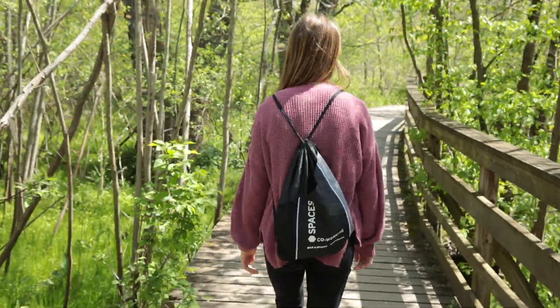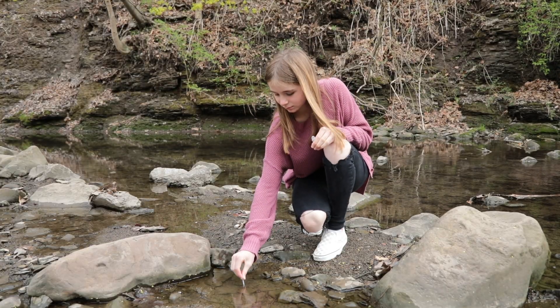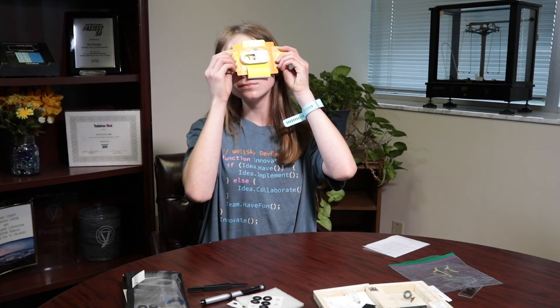Hi, my name is Annabelle. I'm in seventh grade. Today we will be collecting, preparing, and viewing samples.